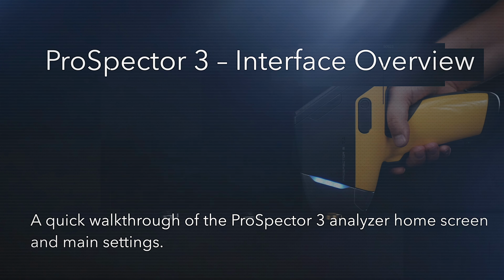And in the top right corner you see the battery indicator. It shows you the battery charge, and if you press the battery icon, you see the notice. This particular battery is charged to 24%, and just press on the notice and it will disappear. In the bottom right corner you see the screen input panel, and in the bottom left corner you see the main menu of the analyzer options.